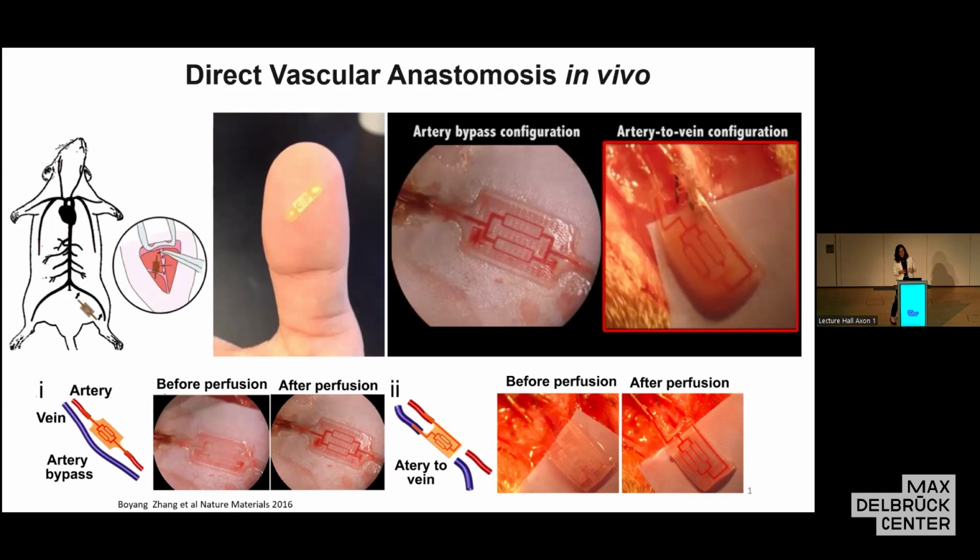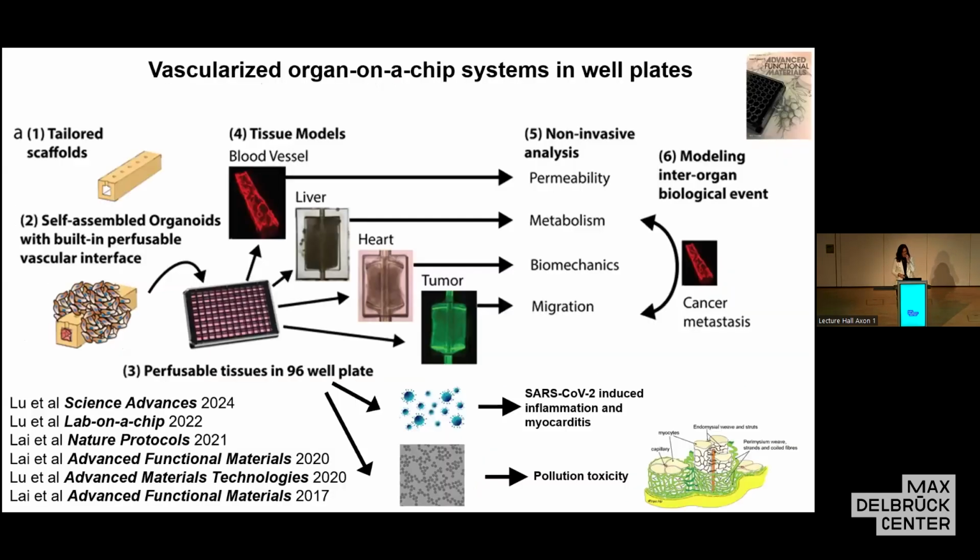You can see that we can establish perfusion immediately, directly hook up the plumbing. And these blood vessels remain open like this for a period of 1 week, at least. The smallest vessel here is about 50 to 100 microns, and the inlet and outlet is 1 millimeter. So it's quite below that 6 millimeter size that we expect to be patent.